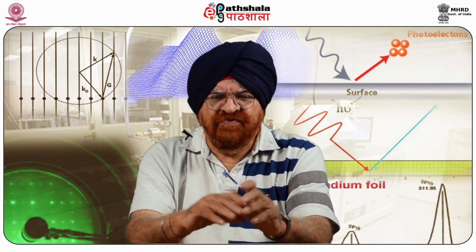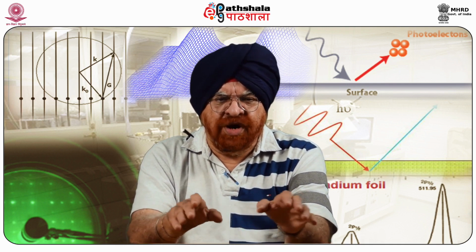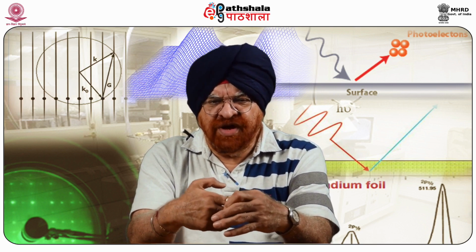In frequency modulated mode, the frequency shift signal F is split into two parts. One goes to the Z regulator, which is primarily for topographic imaging, and the other is fed into the lock-in amplifier.